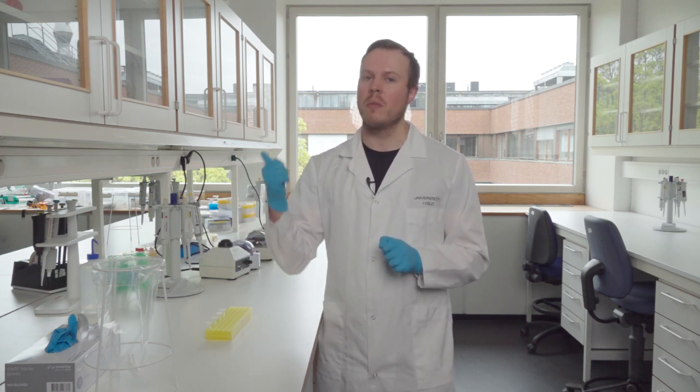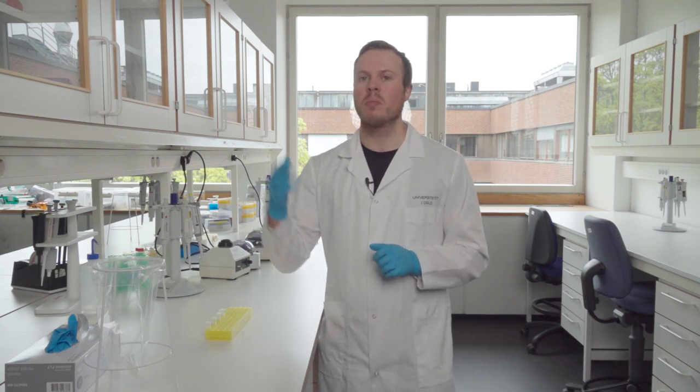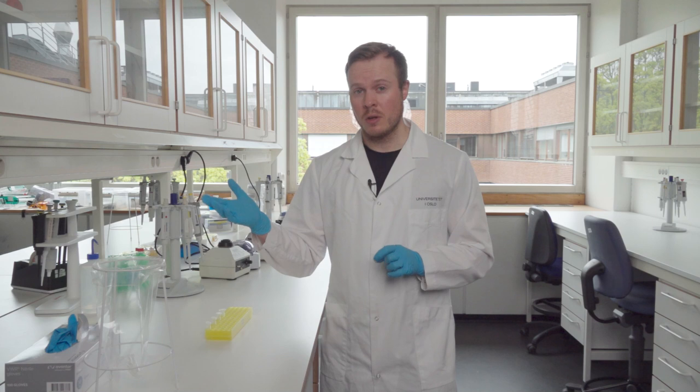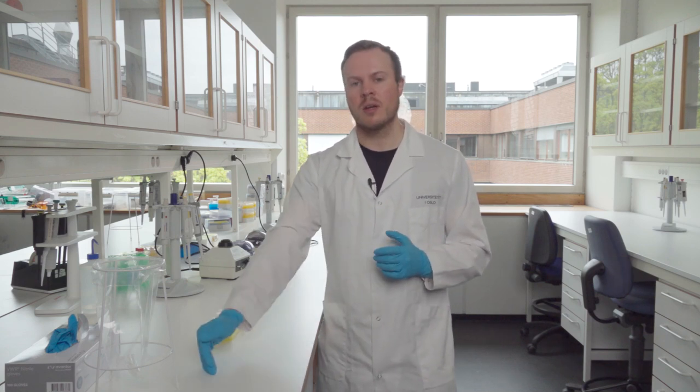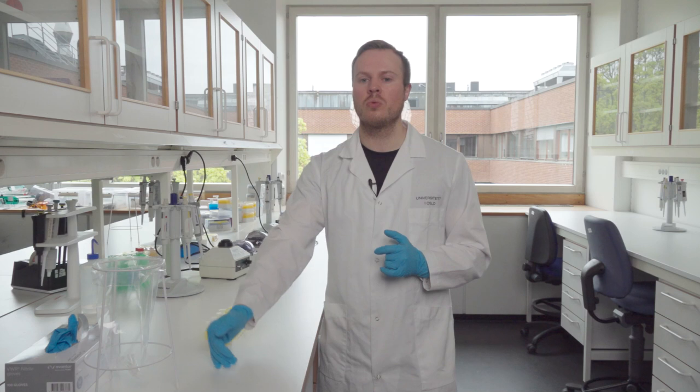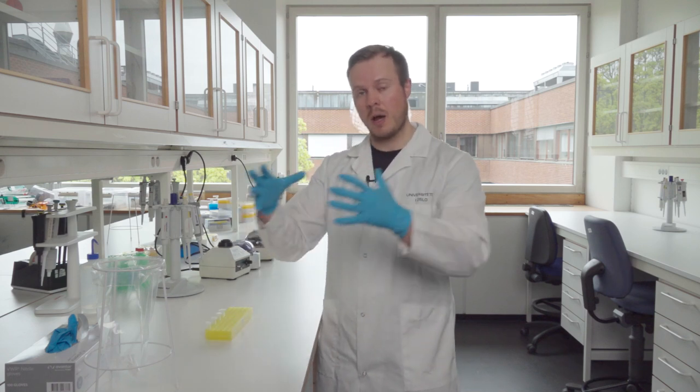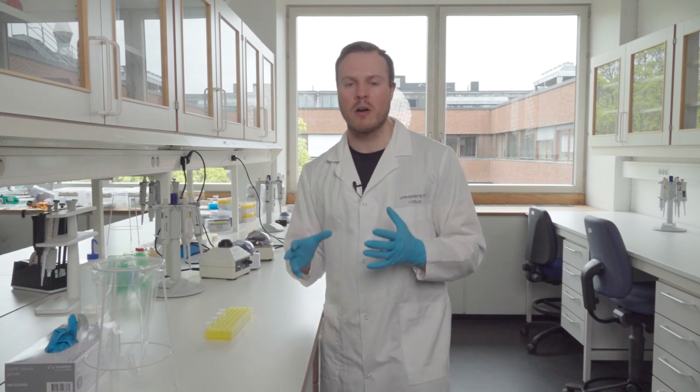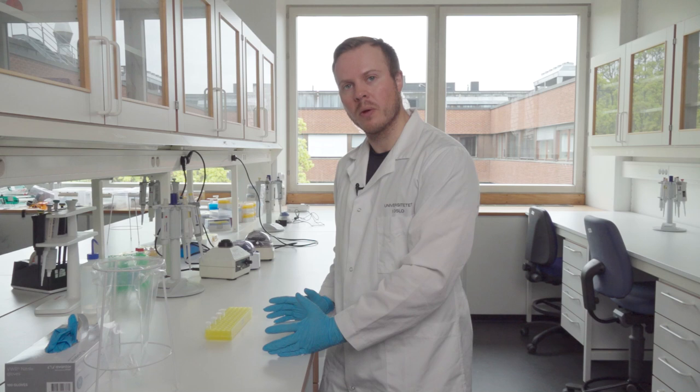But the master mix and the index primers are in the pre-PCR lab. In the pre-PCR lab we do the mixing of the master mix and we also add the primers to all of the different PCR tubes, and then we take out the PCR tubes to the post-PCR lab right here and add our samples here.